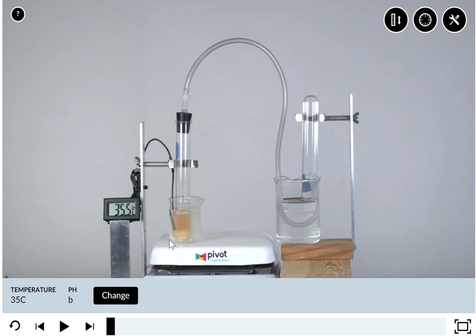Catalase usually comes from, in a lab setting, you can grind up potatoes or put them in a blender, and you get a lot of catalase out of that. So that's in this test tube, and hydrogen peroxide. And when the hydrogen peroxide mixes with the catalase, we know that we get two products of water and oxygen gas. The oxygen gas is going to go up through this test tube into the apparatus here at the top, and then it's going to end up inside of this upside down test tube. And that's where you'll measure the amount of oxygen gas that gets produced.